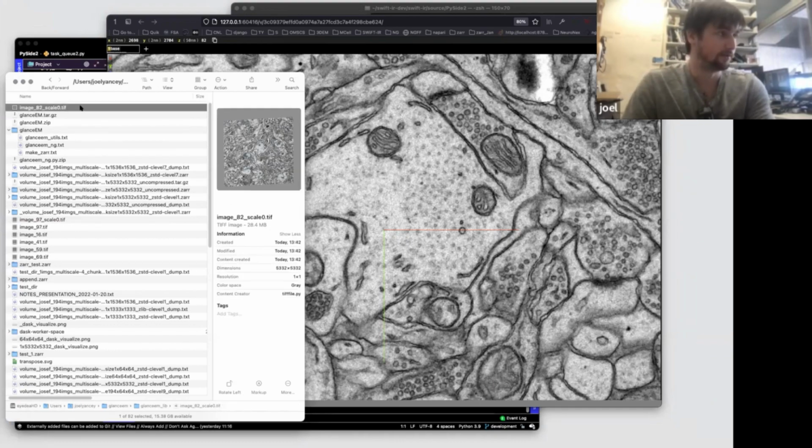And we can also do this in different scales. By default right now, it's unzarring it, basically. It's unchunking it, but I'm unchunking the scale 0 image, so the full resolution image. And I guess this is also a good demonstration that this is lossless compression, so it's all reversible, the compression. So it's not a scary word, we're not fundamentally altering the original images.